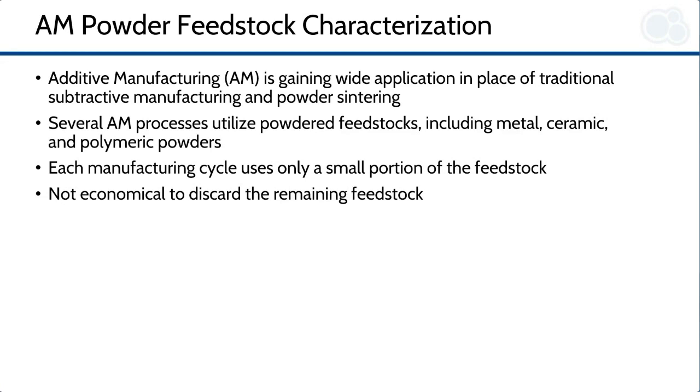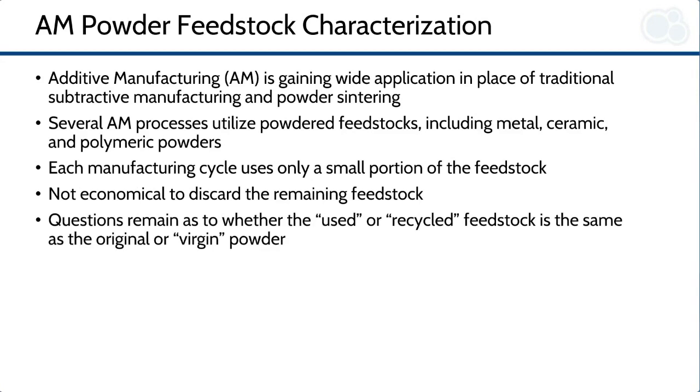Removing the remaining feedstock or replacing it is not economical in terms of powder cost, as well as disposal charges. It is far better to reuse than to refuse or discard. Of course, we must ask whether the feedstock has changed significantly by the printing cycle and whether it is still suitable for usage in another printing cycle.